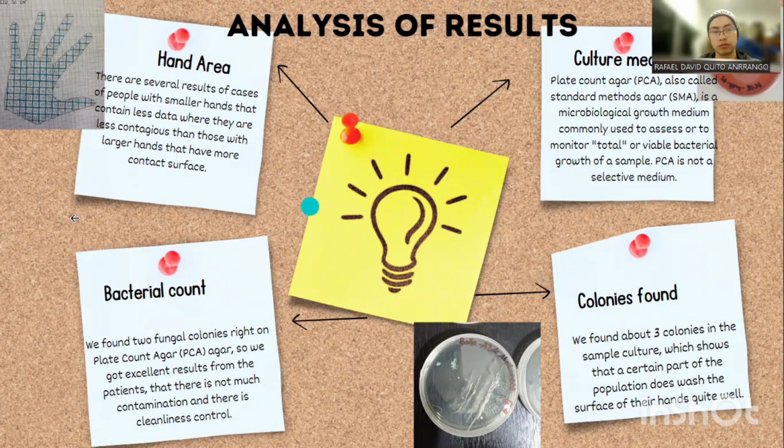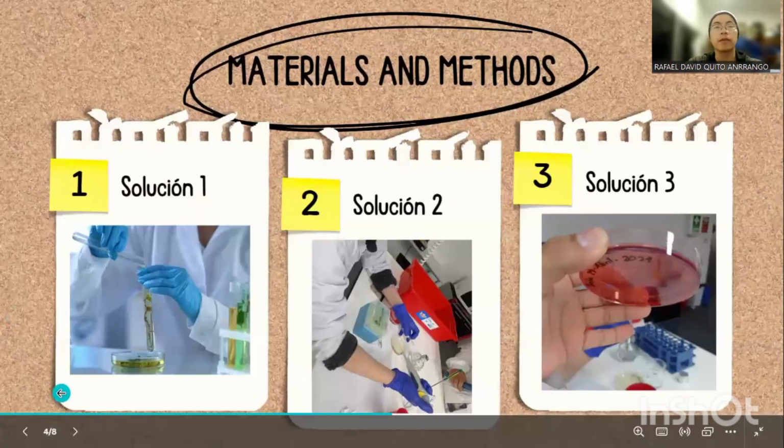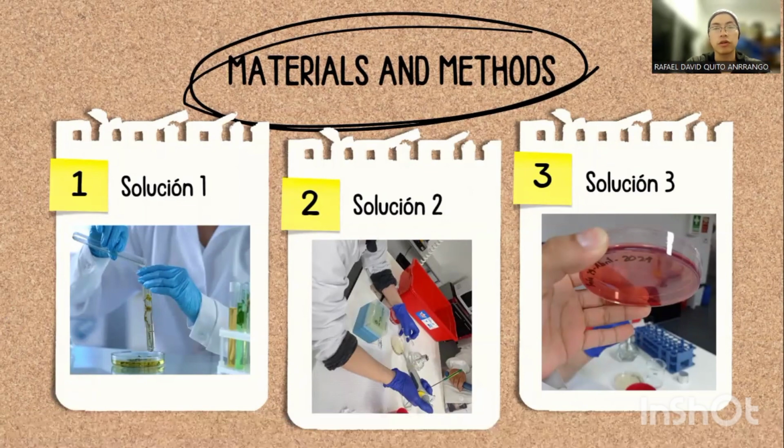Preparation. First, organization of the group work in their laboratory groups. Assign specific roles for each member, such as sample collector, taking pictures and data, and cultivation managers for each culture. Make sure the swabs are sterile and ready to use.